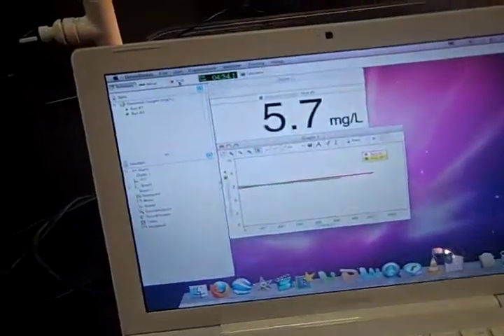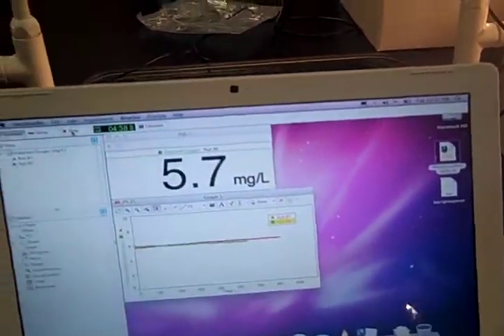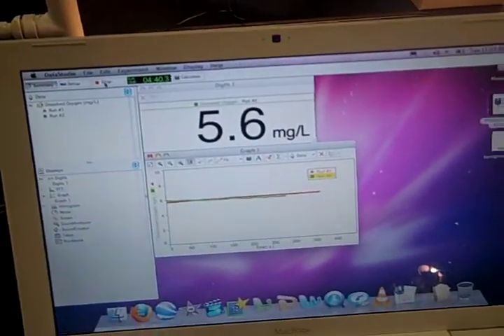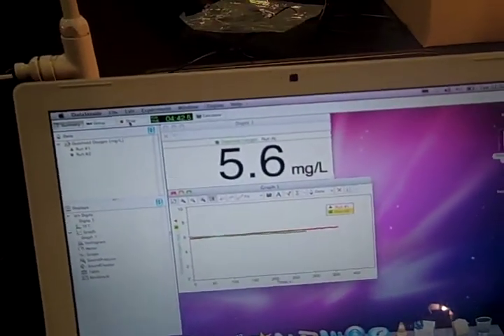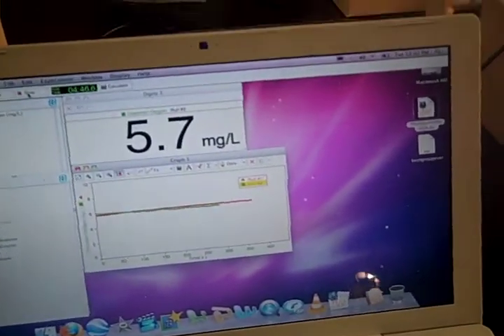Our prediction for the lab is that the graph will show a decrease and an increase from the results. Just like at first with no plant inside it, with nothing in it, the photosynthesis is slowly going up, and now it started to go down again. It started to go down when we put the plant inside. So we think it's going to go down for a while, and just shoot back up after a little while.